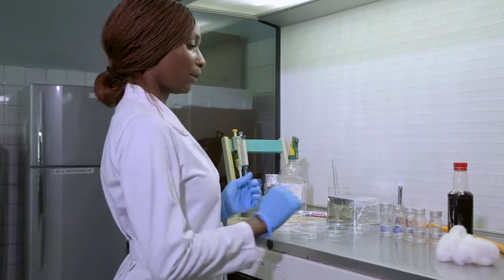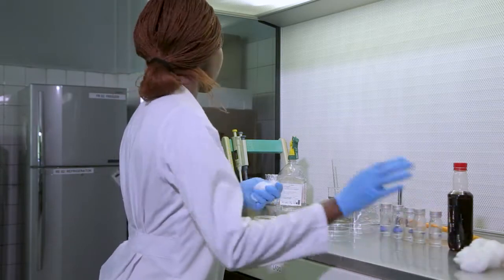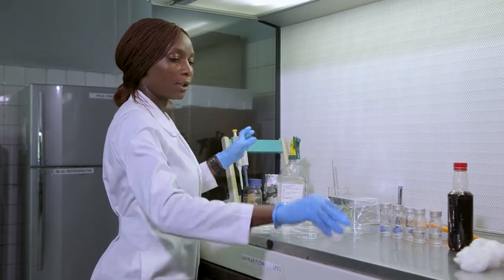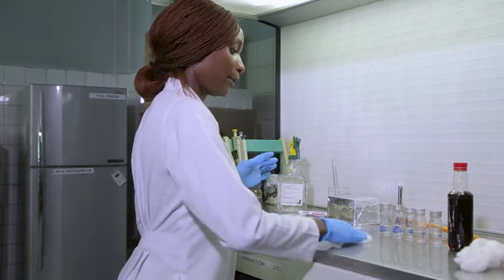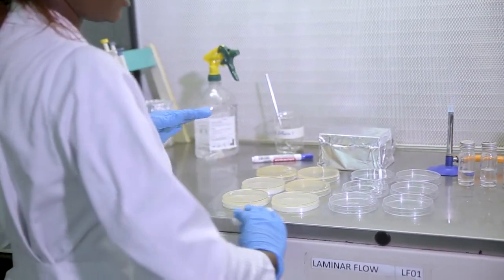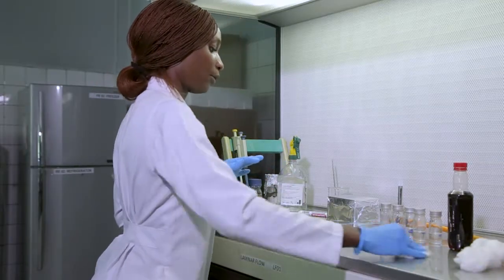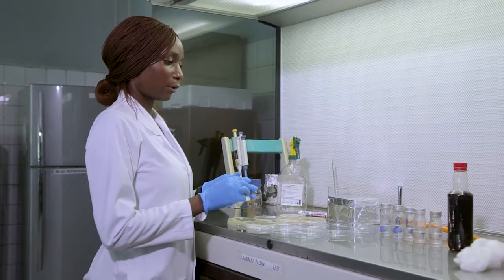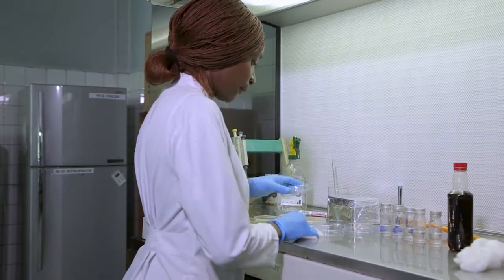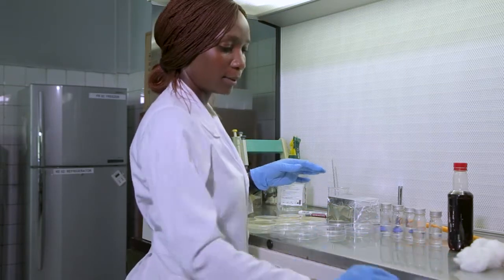So to begin with, we make sure that we work under aseptic conditions. All the reagents or materials that I'm going to use here have been sterilized prior to use. We are going to use disposable Petri dishes. These come already sterilized from the manufacturer. So I swab the area, the surface I'm going to work on, using 70% ethanol.